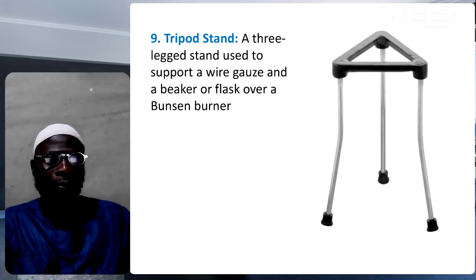Tripod stand. It's a three-leg stand used to support a wire gauze and a beaker or flask over a Bunsen burner.